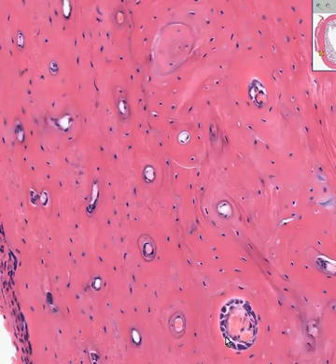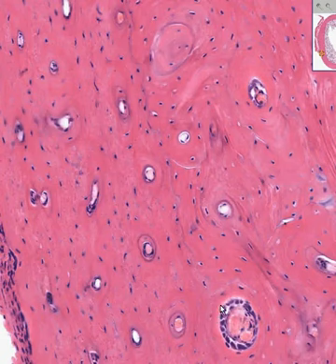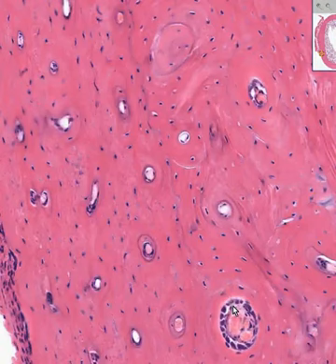These are actual osteoblasts. So when an osteoblast is completely trapped within hydroxyapatite, that is then called an osteocyte. Just like when a chondroblast is completely trapped up within chondroid matrix, this goes from chondroblast to chondrocyte. In bone, it goes from osteoblast to osteocyte.